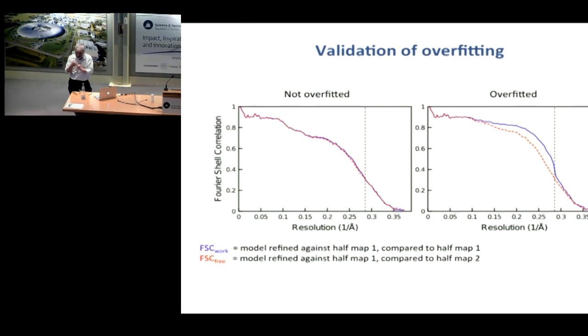there are tools. You can give matrices, or if you have sequences, then you don't have to give anything. Then you say that you want to use NCS, and the program will calculate all the matrices and all the local similarities and so on. Did I answer your question?